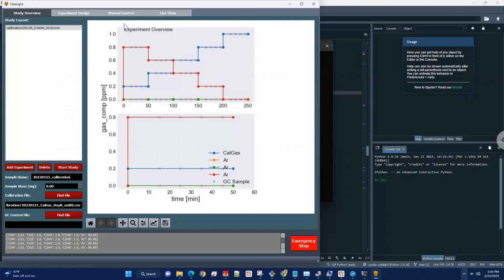All right, welcome to today's training video. We're going to cover how to run calibration analysis for calibrating your GC to use with Catalight.